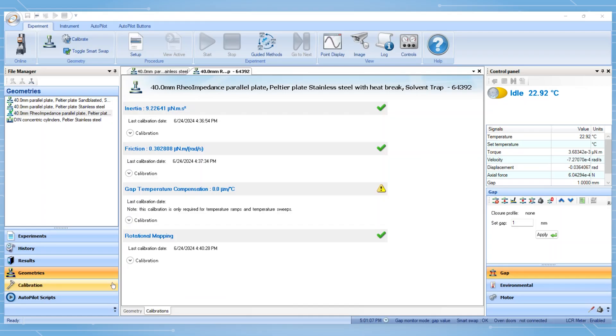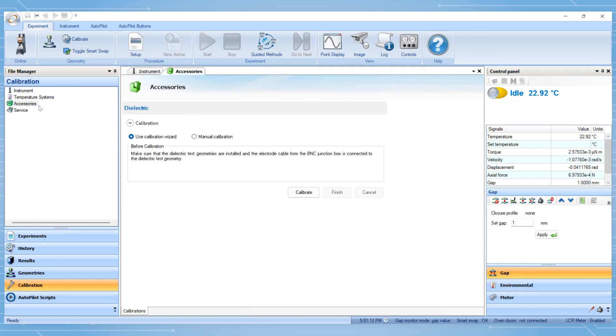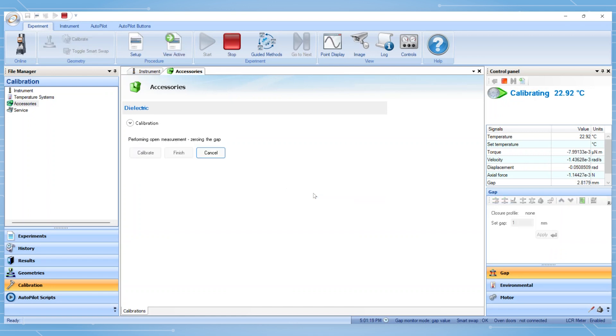To perform the open and short calibrations, navigate to the Calibration tab, select Accessories, then choose Use Calibration Wizard, and select Calibrate. Follow the wizard prompts.